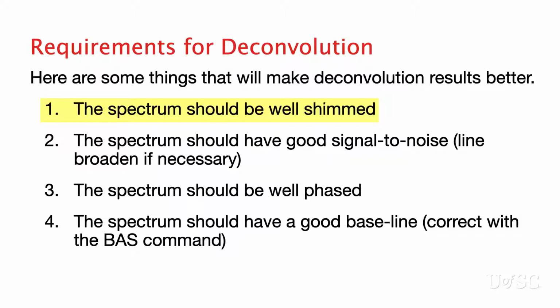Make sure your samples have the correct solvent height and are filtered from any floating particles. Exponential line broadening can help, but it is not a substitute for good data. The spectrum should have good signal to noise. This will help the simulation fit the peak baselines. Use some extra line broadening if necessary.